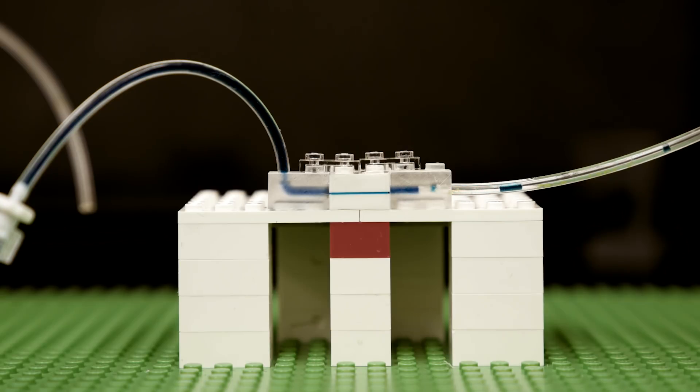By snapping, clicking, and connecting a series of interlocking injection molded blocks, MIT researchers have designed a new modular microfluidic device that can mix, sort, and pump fluids for various needs and applications.